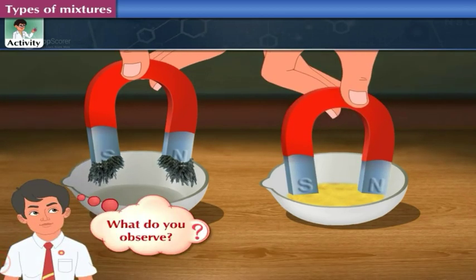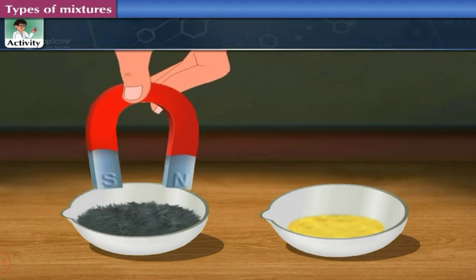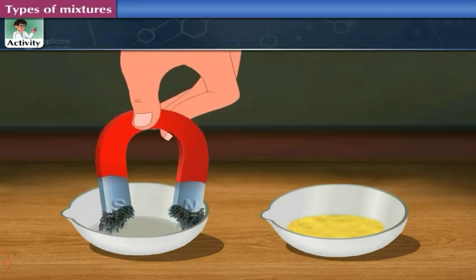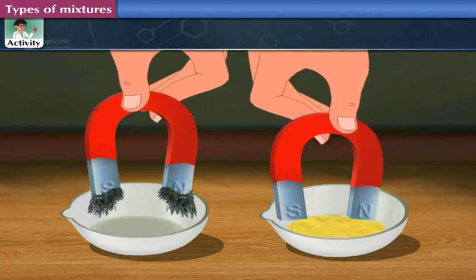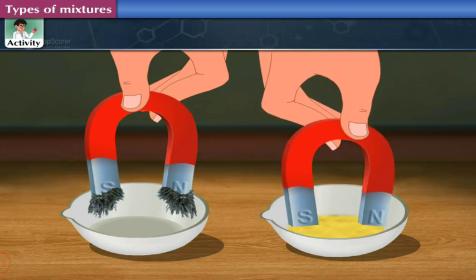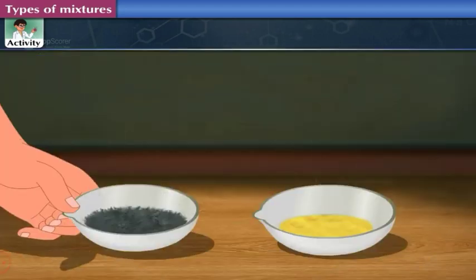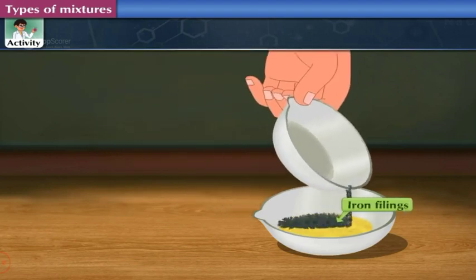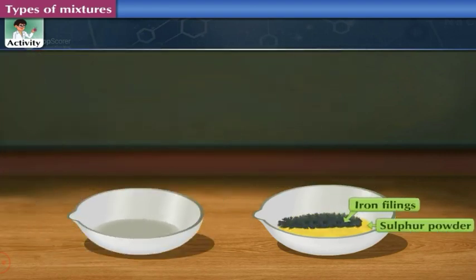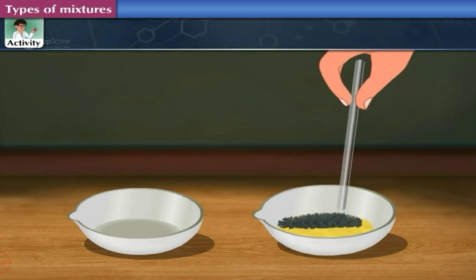The iron filings cling to the magnet, but the sulfur powder does not get attracted to the magnet. Now transfer the entire iron filings into the dish containing sulfur powder. Stir the contents using a glass rod.